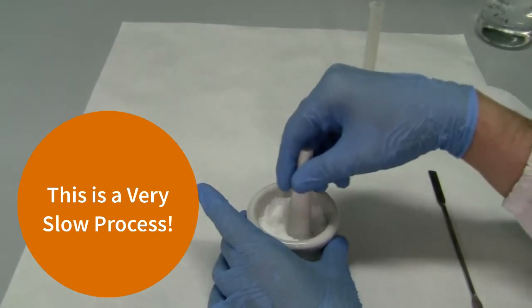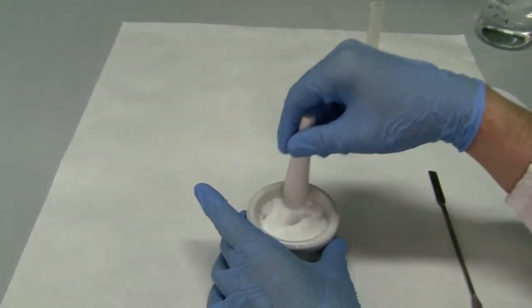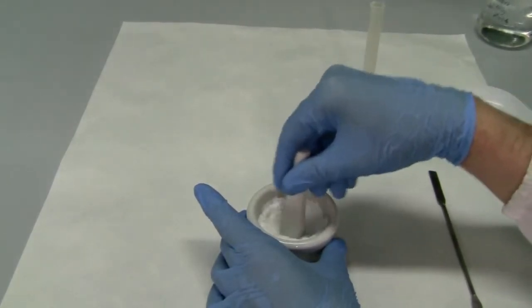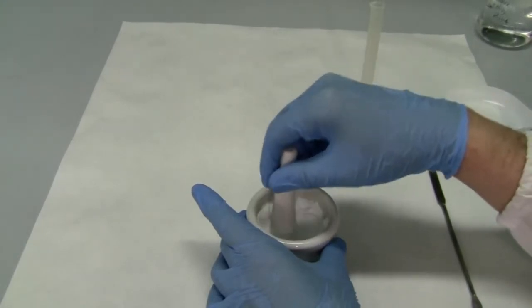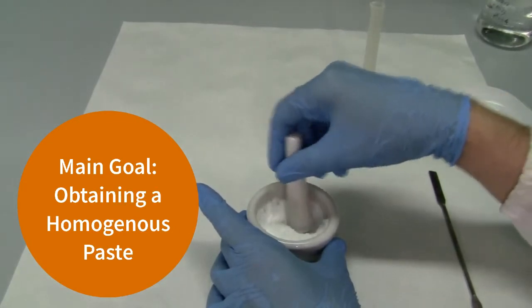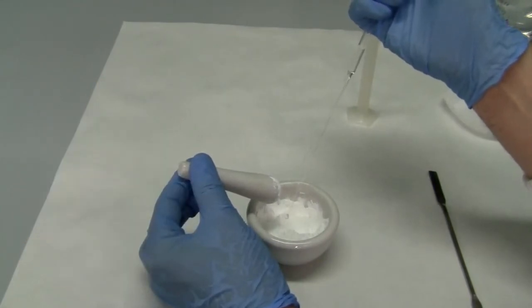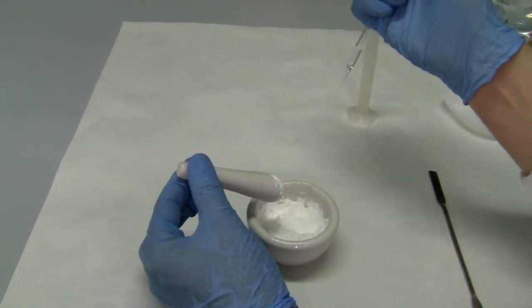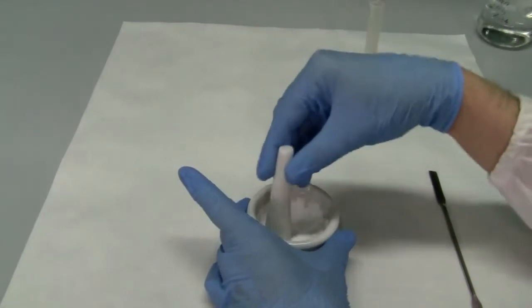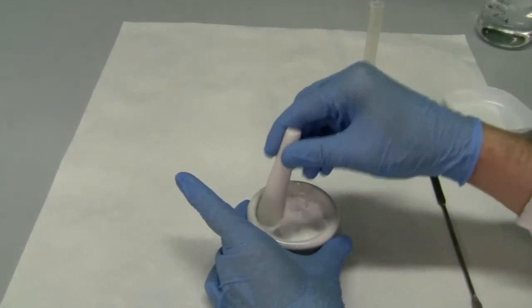during time, a paste. The use of an acid solution having pH around 3-4 is needed because the titania in its surface is simply showing a lot of hydroxyl groups, and the presence of an acid will protonate some of them, making it possible for the different small particles to stay away from each other. So we can make a deposition of a paste in which there are no specific aggregates. So the last goal of our preparation is to have a paste which doesn't show any aggregation, nor at macroscopic and microscopic level.